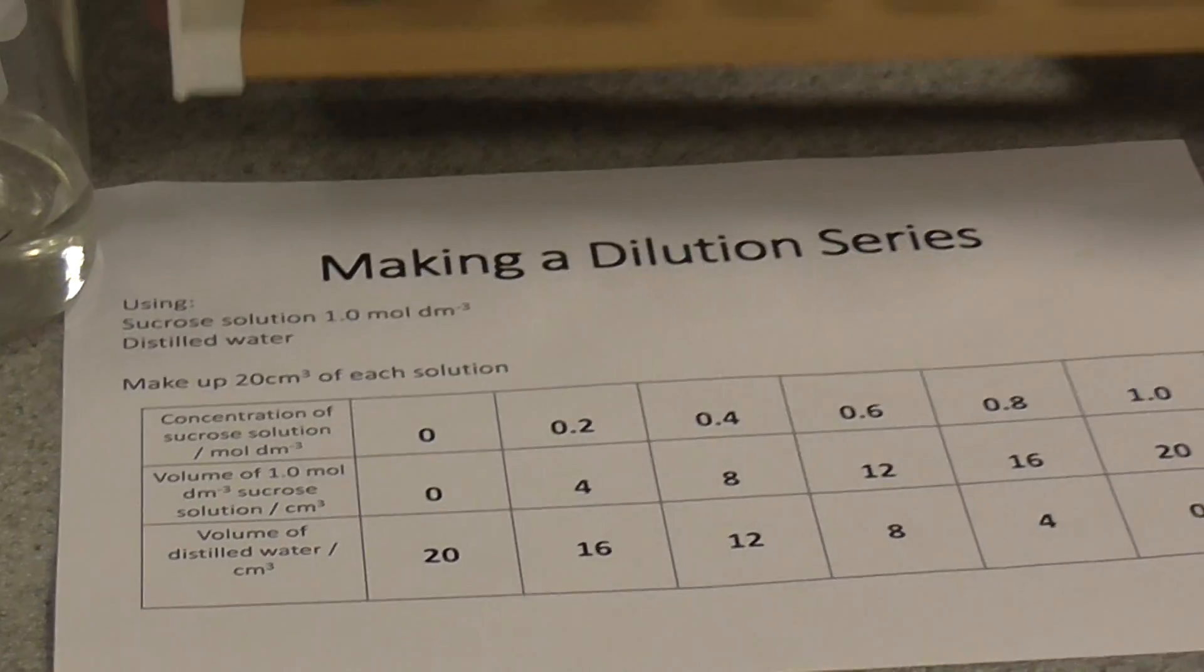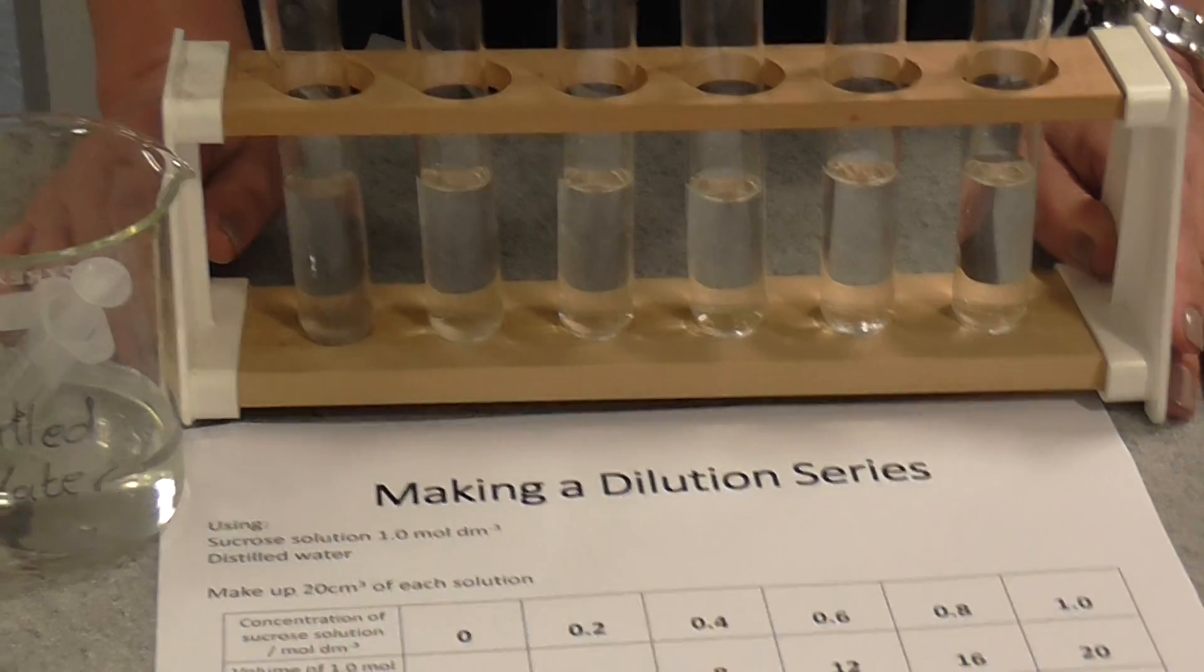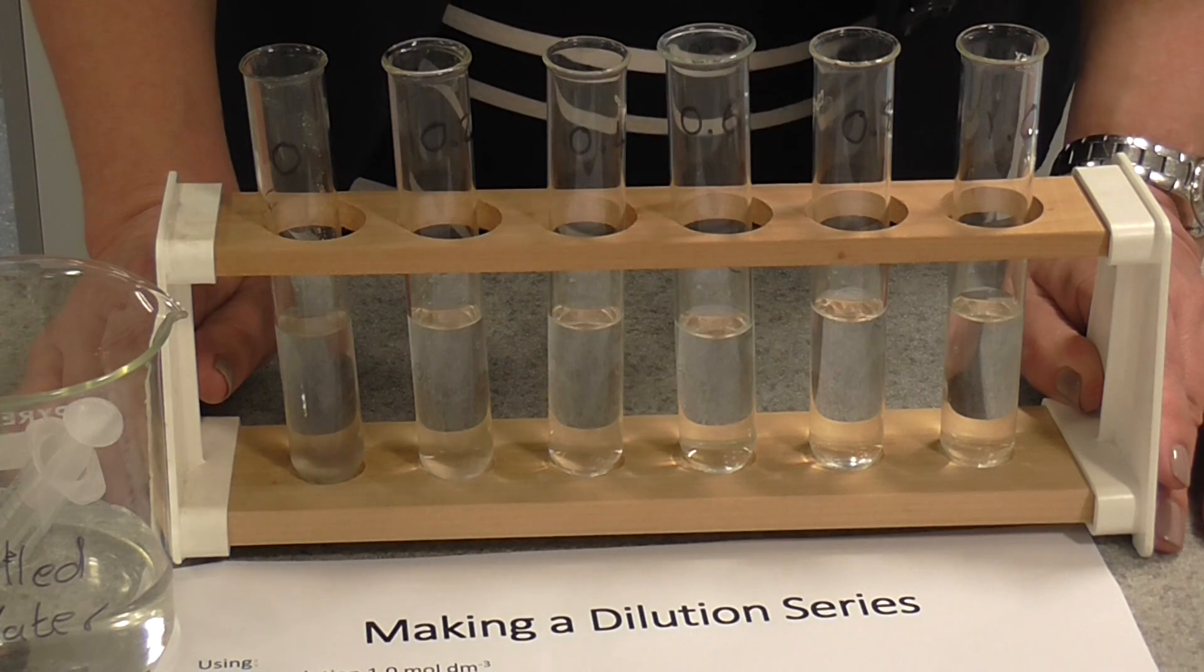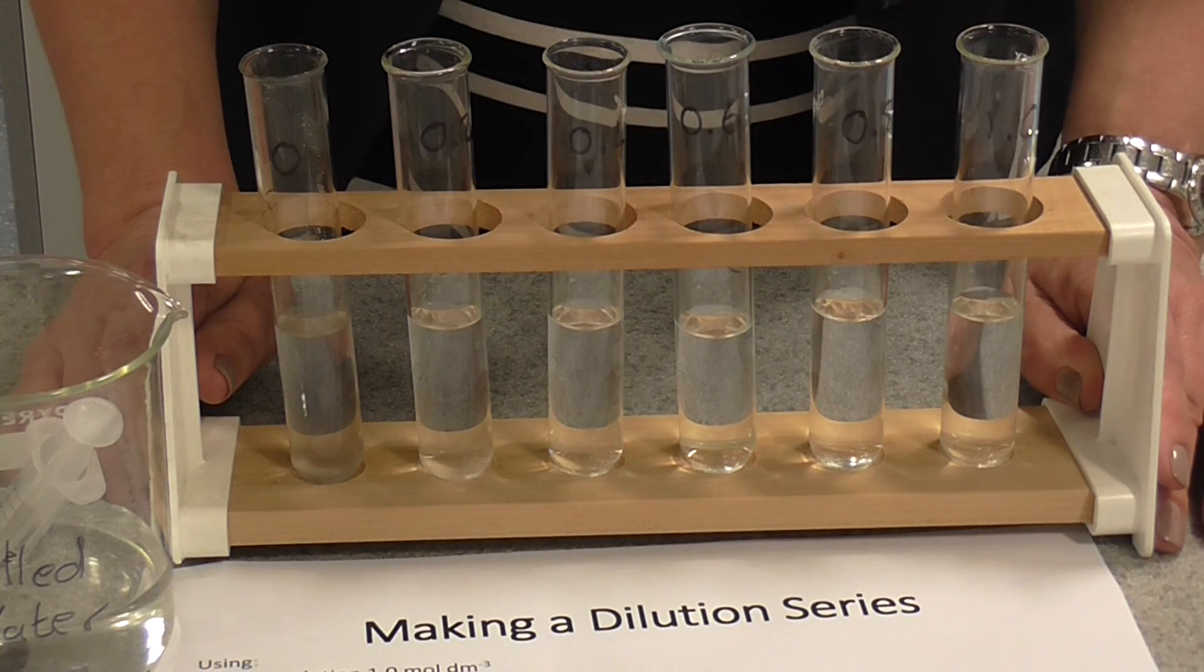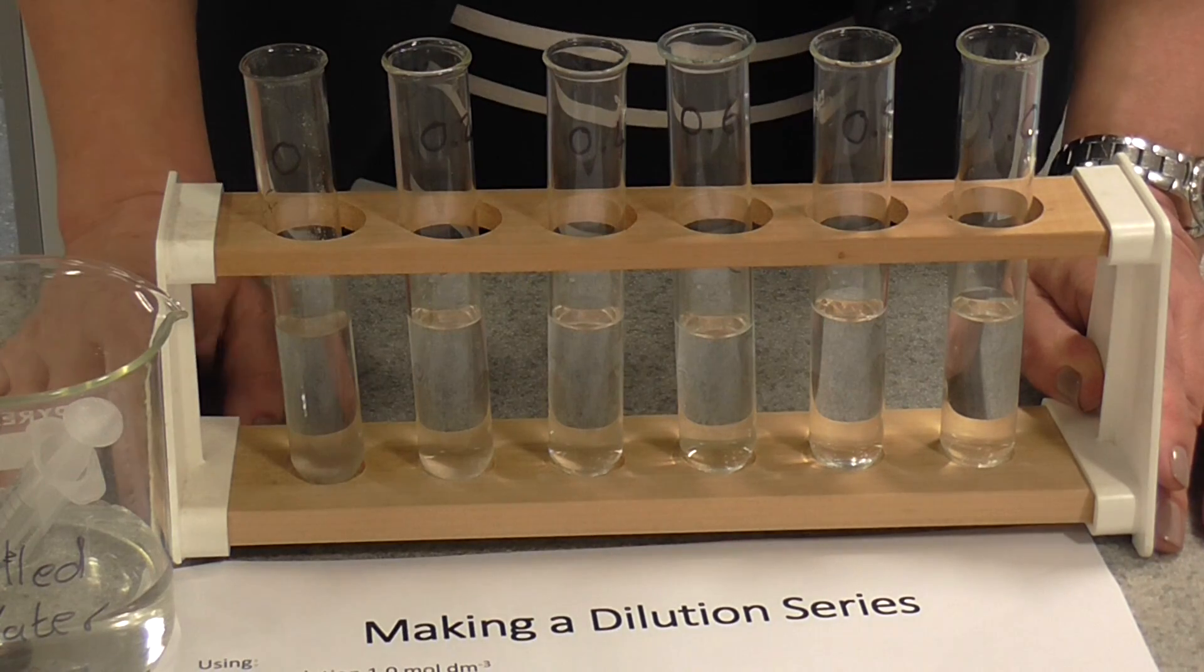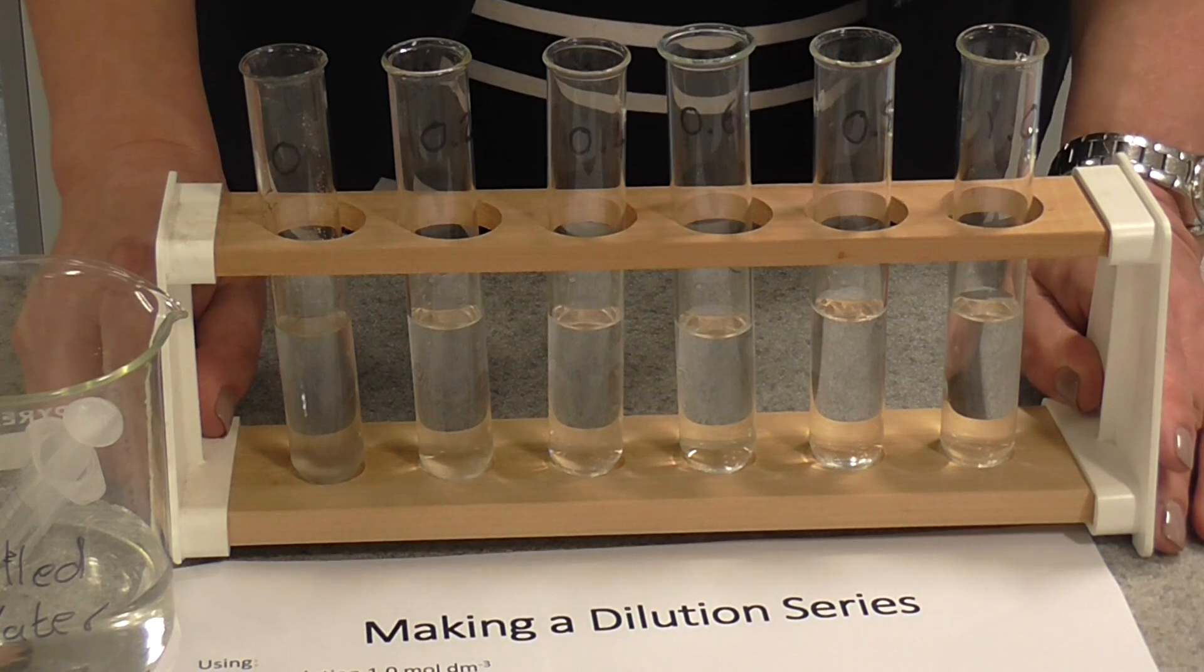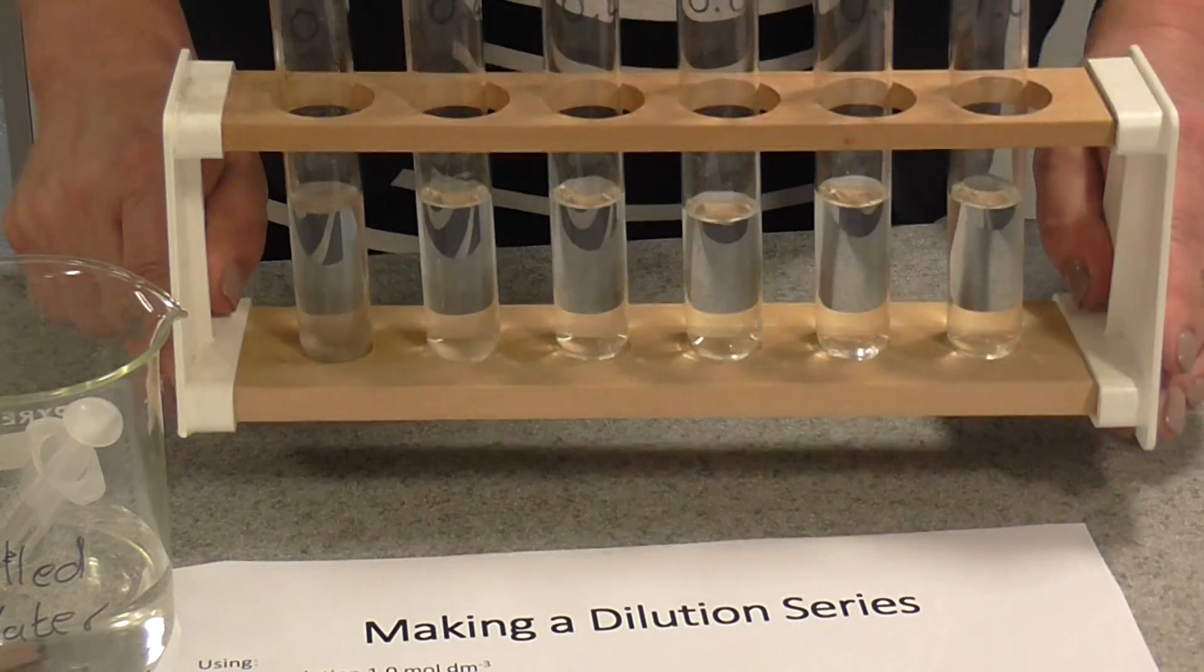As soon as you've done that, your different sucrose solutions need to go to a water bath to equilibrate at 25 degrees Celsius. Twenty-five or thirty degrees both work fine for this experiment. That means to allow them to come to a set temperature so that temperature is not a variable that might affect the results in this investigation. I'll just pop those in the water bath now.